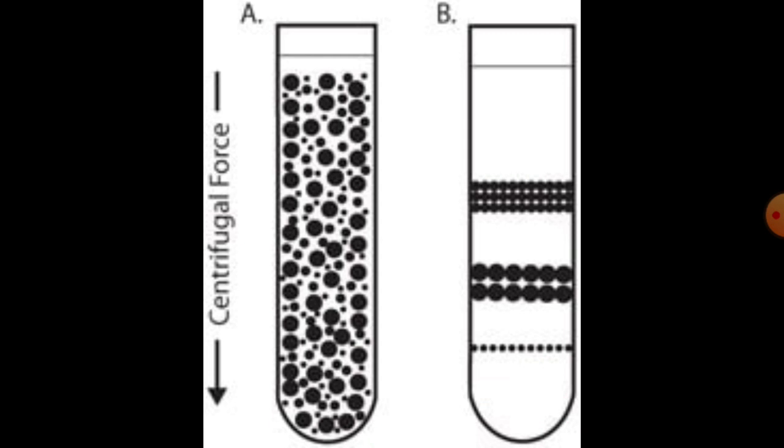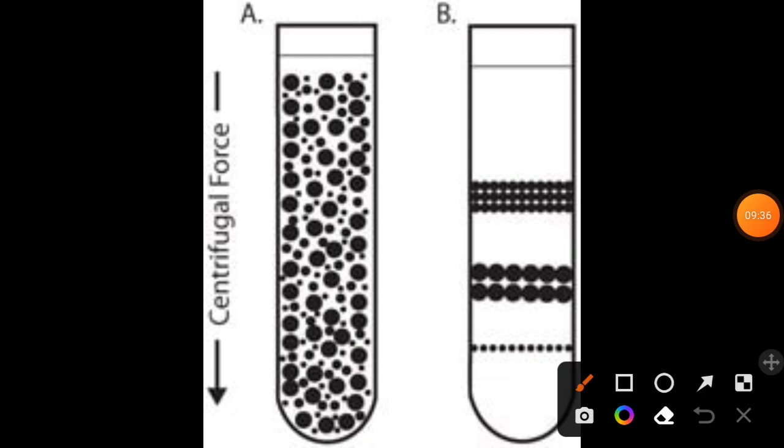So that is the completion of the topic, and I want to explain another important thing: the different properties we should keep in mind when we choose the matrix forming substrates. First, the matrix forming substrate should be cost effective. It should be easily autoclavable. It can be easily separated from the samples. And it cannot be metabolized by the samples.